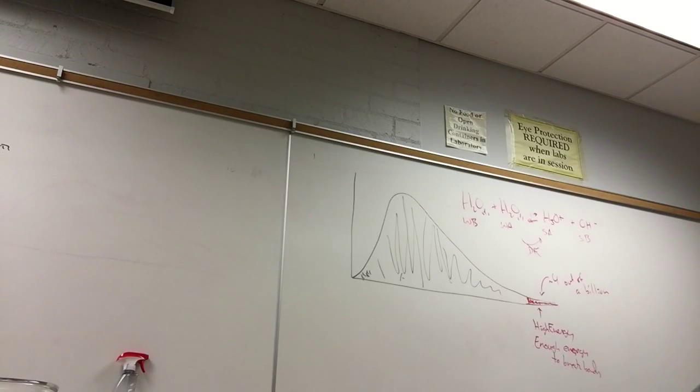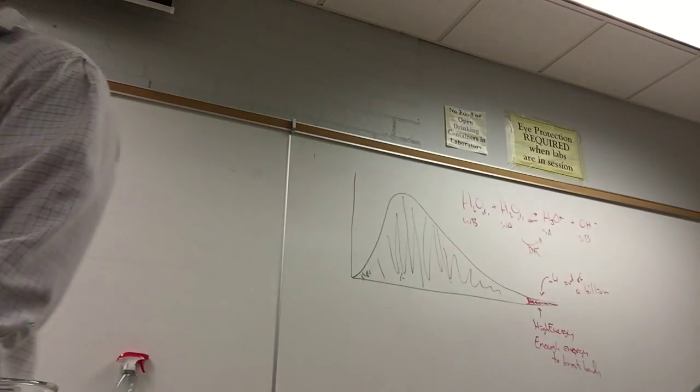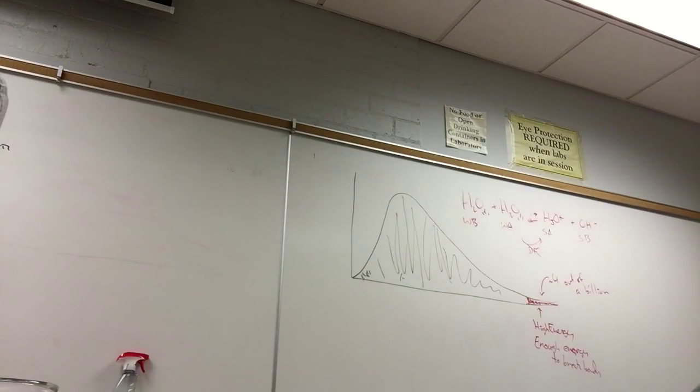When you buy sodium chloride from a manufacturer, it comes in a bottle like this. This is very expensive sodium chloride. Purity is fairly high, but not exceptionally high. This is like 99.5% or something like that pure. Maybe higher.